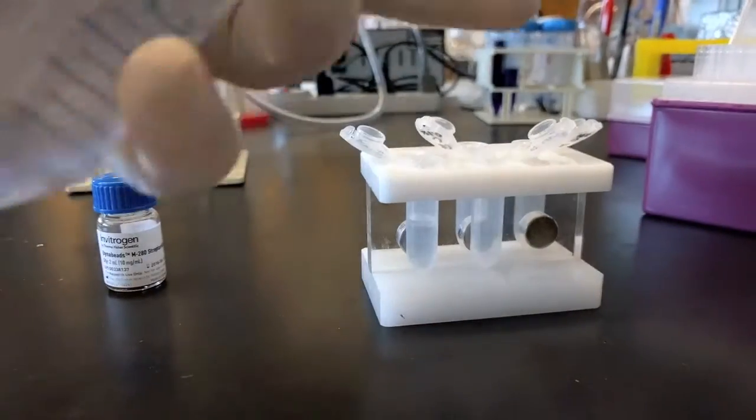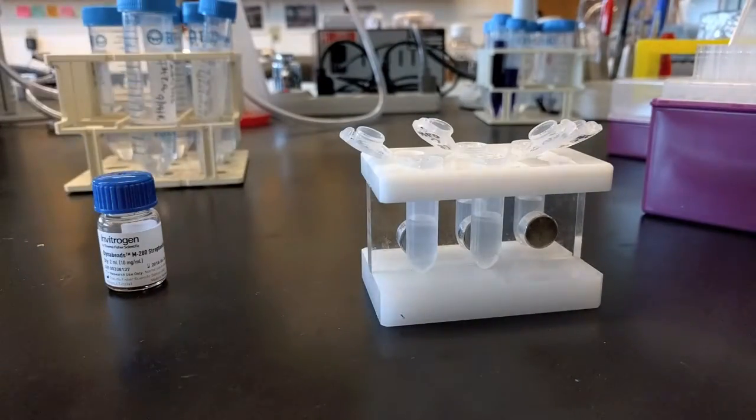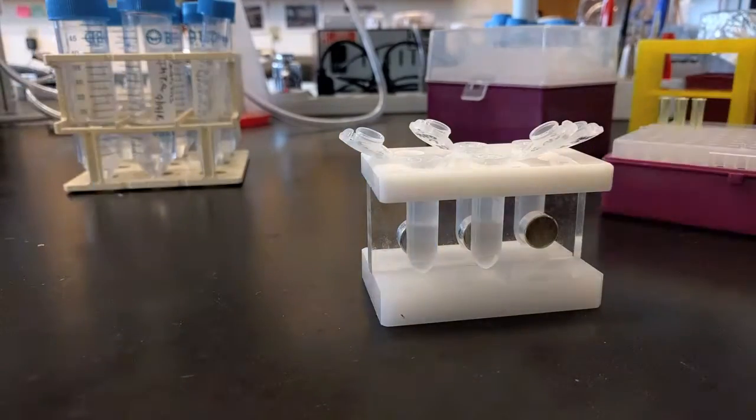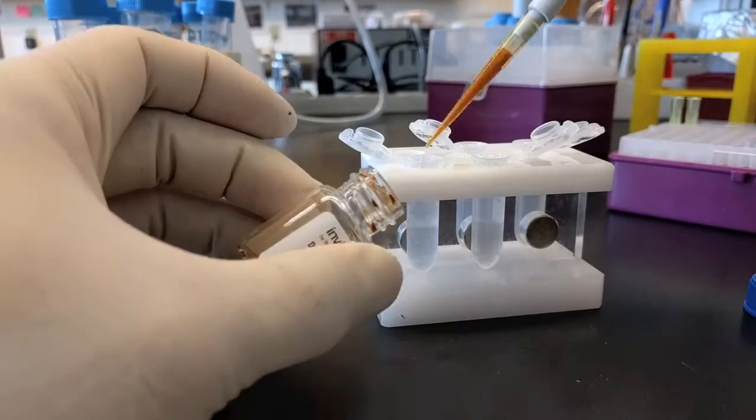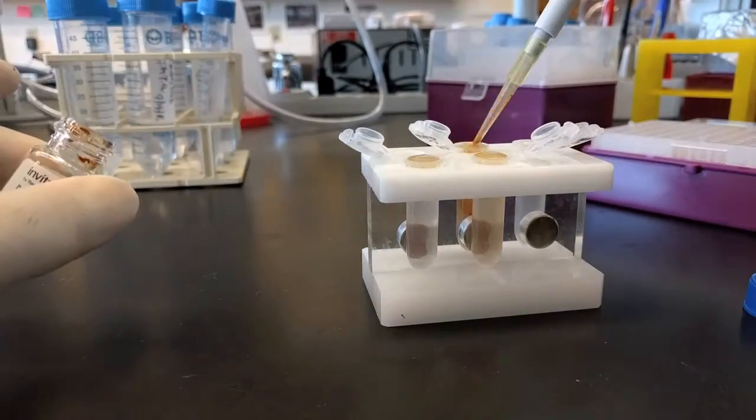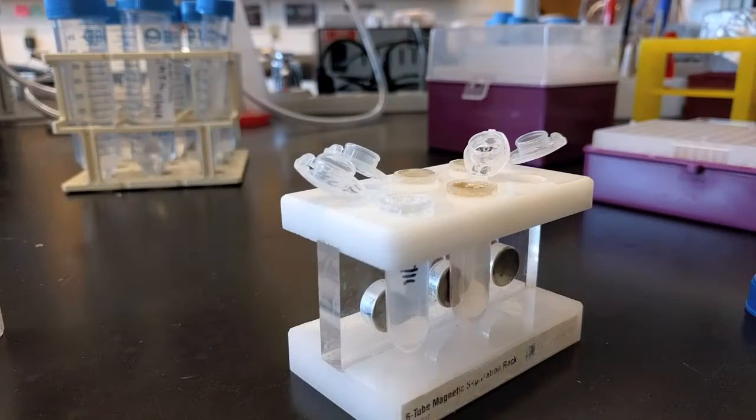Here I'm preparing the magnetic particles and washing them. You'll see that the magnetic particles will be attracted to the magnet, which is that circular silver object right behind the tubes. You can see the magnetic particles slowly get attracted to the side.